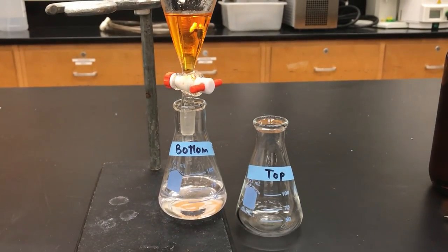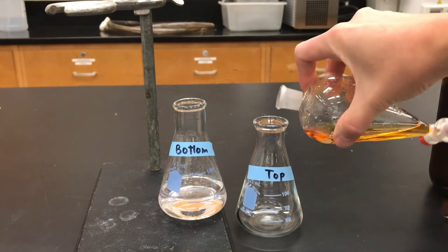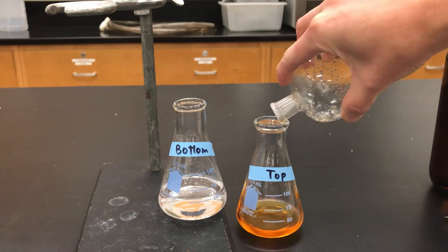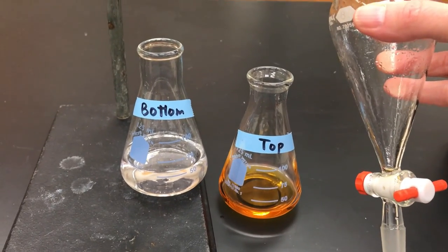Once the bottom layer is drained out, take the separatory funnel and pour the remaining liquid out the top — that's the best way to avoid mixing the two layers. In this way we've successfully extracted methyl red into ethyl acetate and separated the layers.